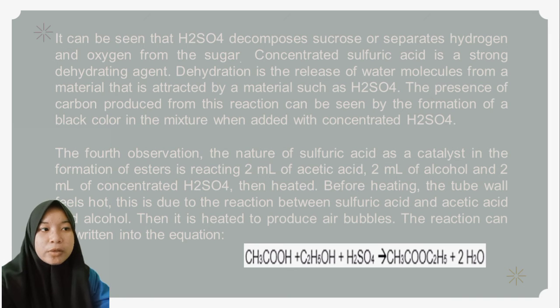Dehydration is the release of water molecules from a material that is attracted by a material such as sulfuric acid. The presence of carbon product from this reaction can be seen by the formation of a black color in the mixture when added with concentrated sulfuric acid.